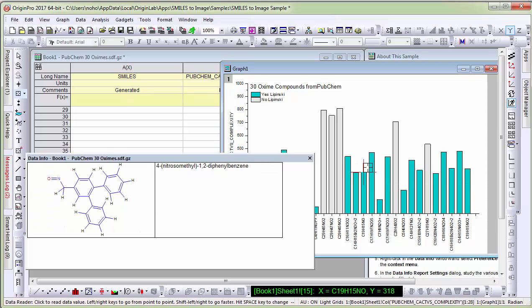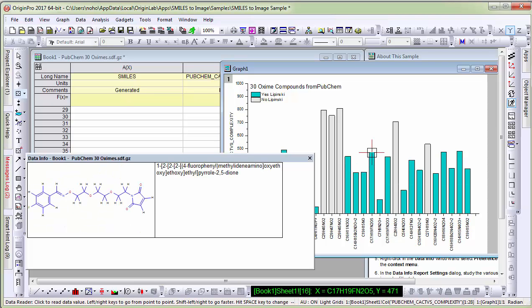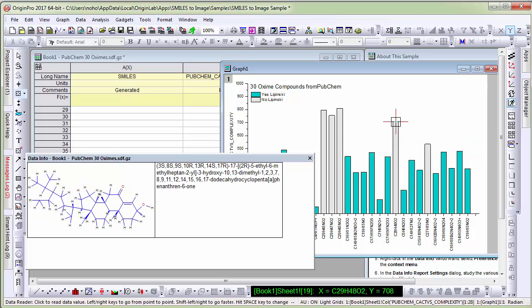you can see that the data info is retrieving the image of that particular row from the worksheet and displaying it in data info.